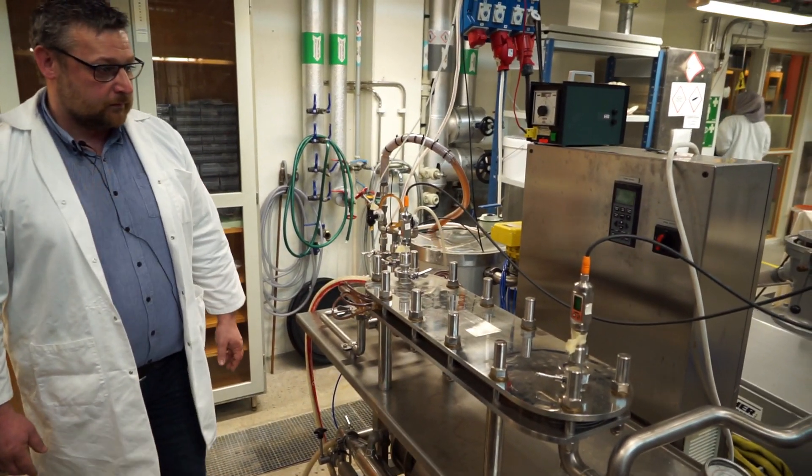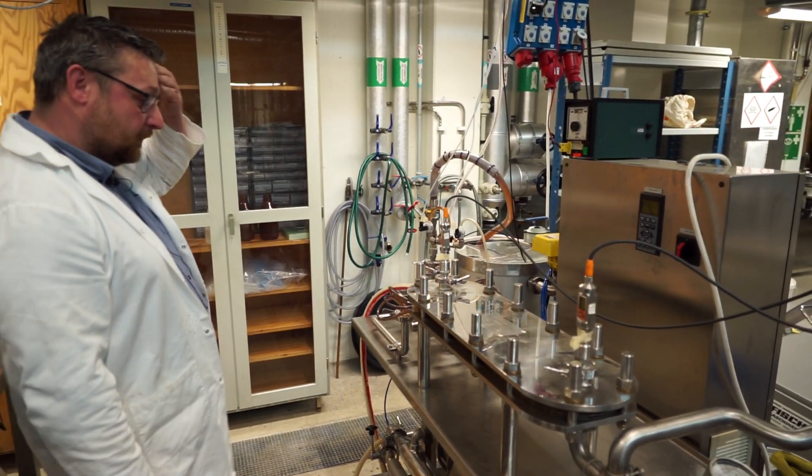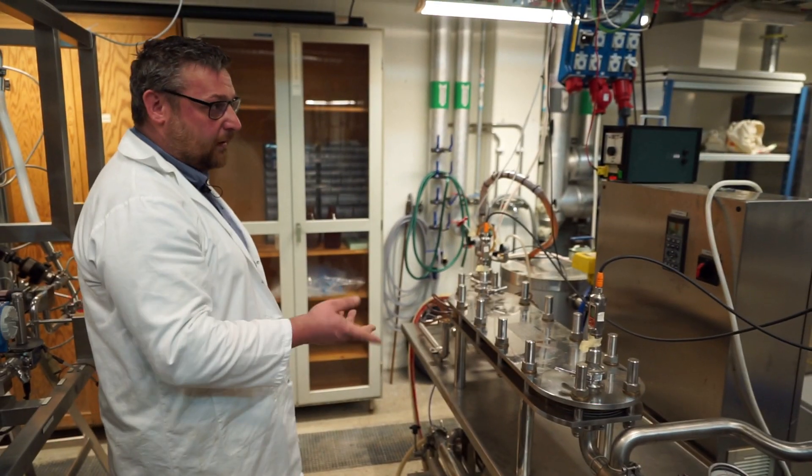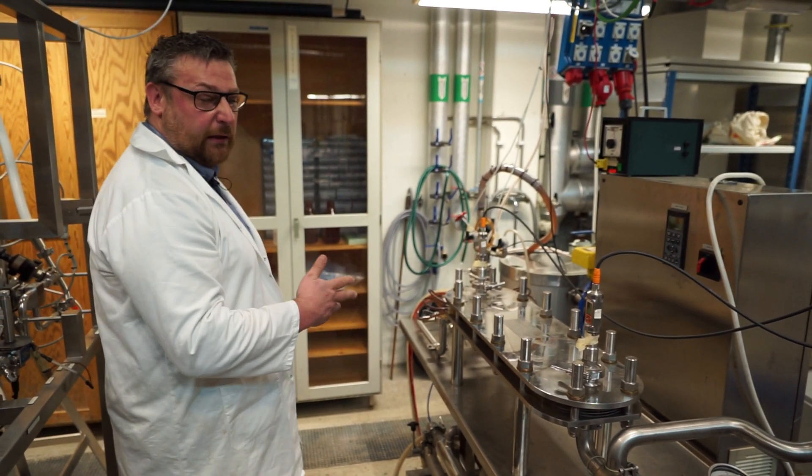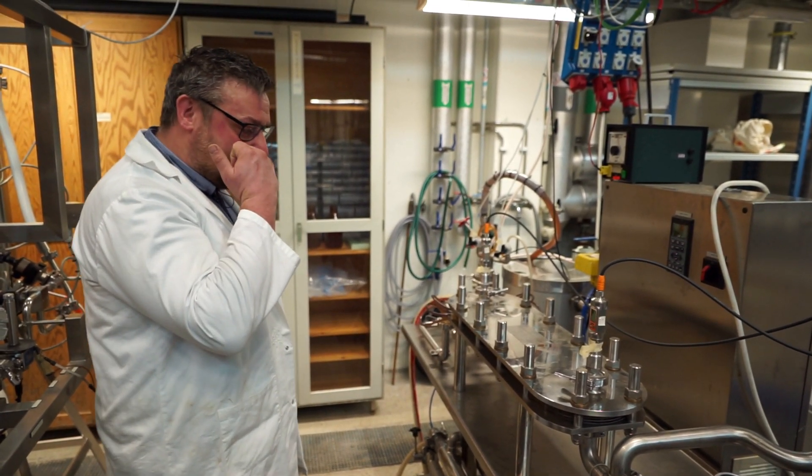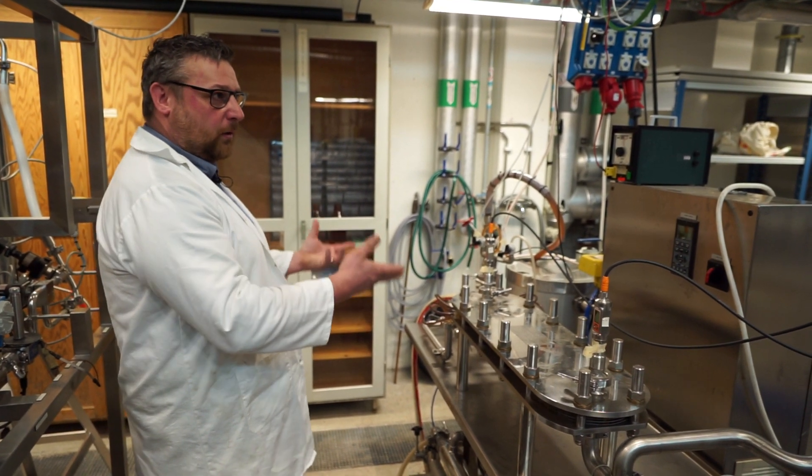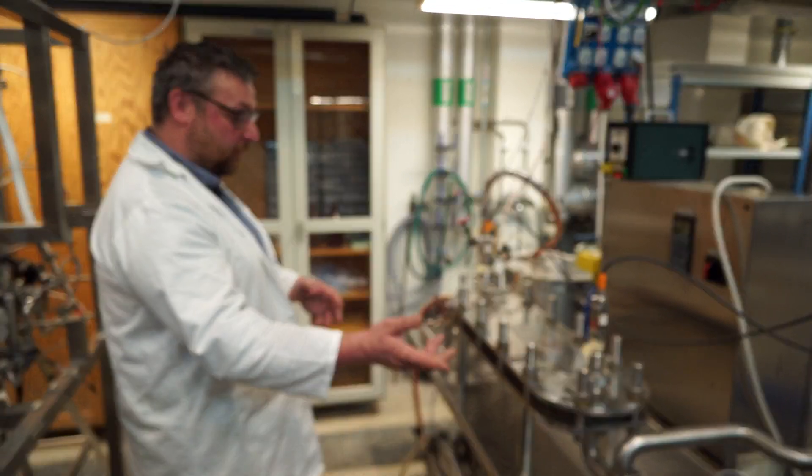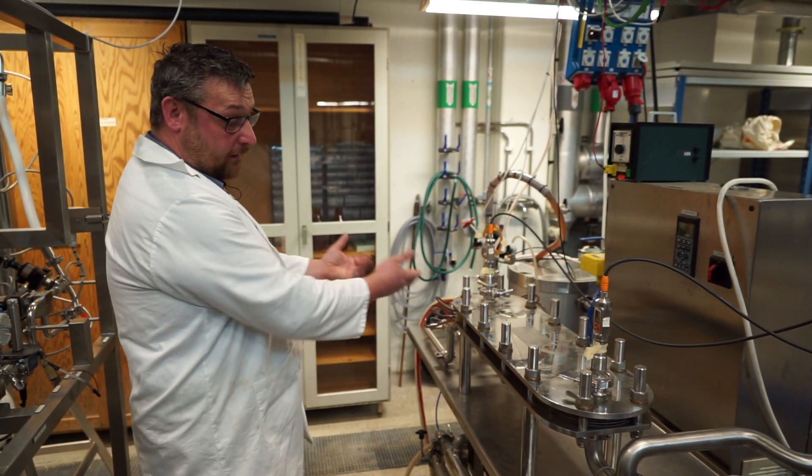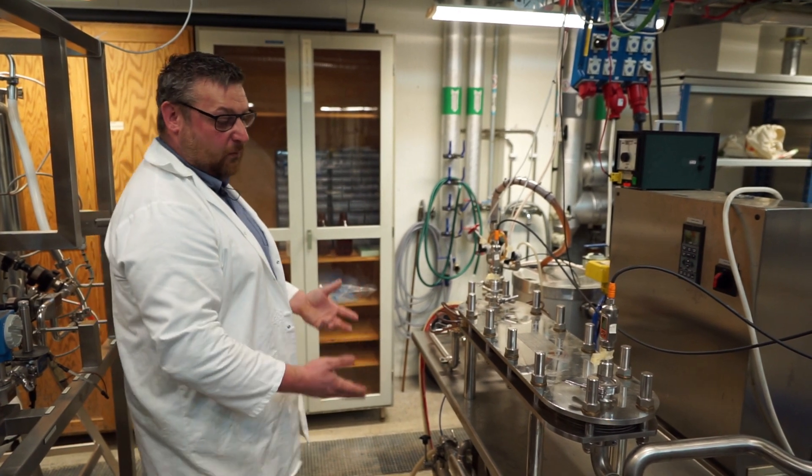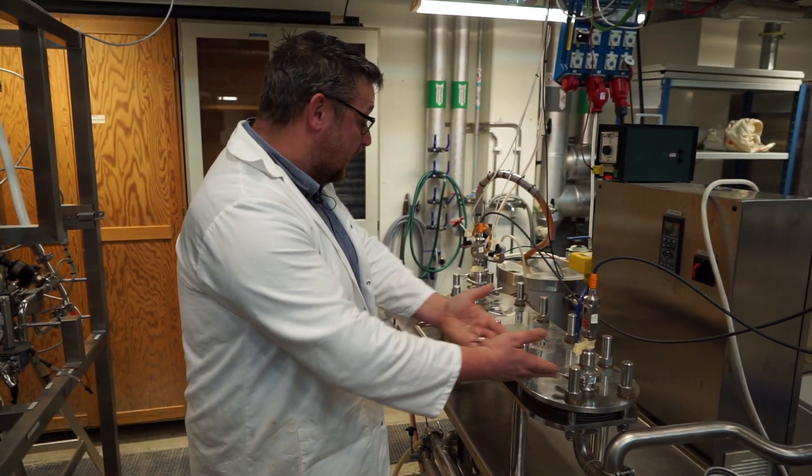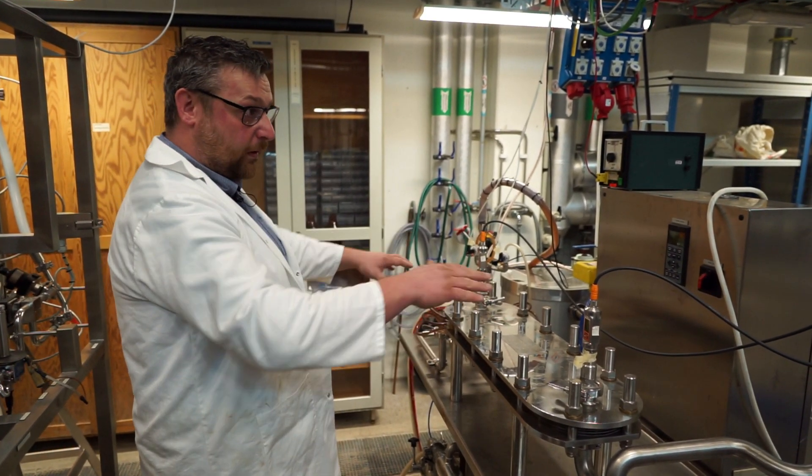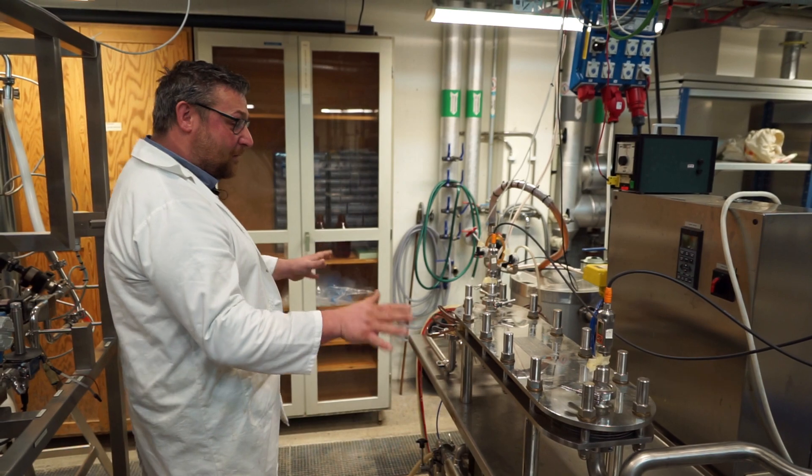But this also means that you don't have the same transmembrane pressure over the entire equipment. Exactly. And that is one thing that one needs to take into consideration, especially for microfiltration and ultrafiltration. Those are processes run at fairly low transmembrane pressure. So, a high pressure drop will influence what happens in the beginning and in the end. But in a reverse osmosis setting where we have maybe 60 bar here and 55 bar here, it wouldn't make a difference, not to the same extent, at least.